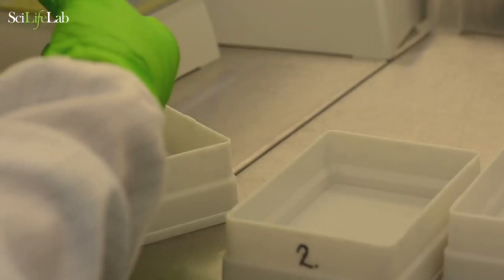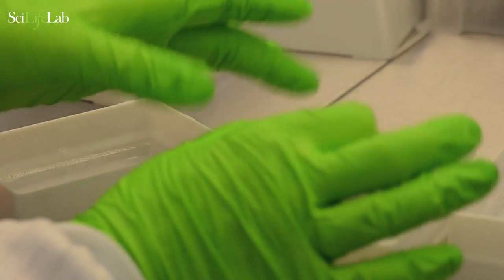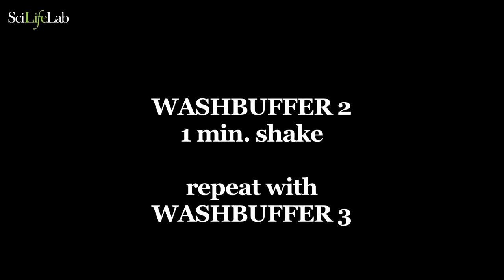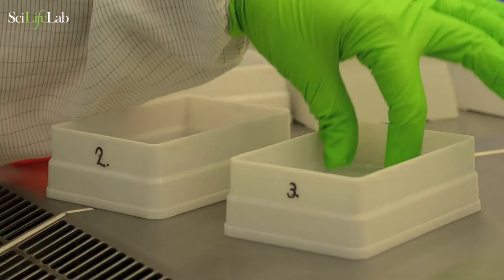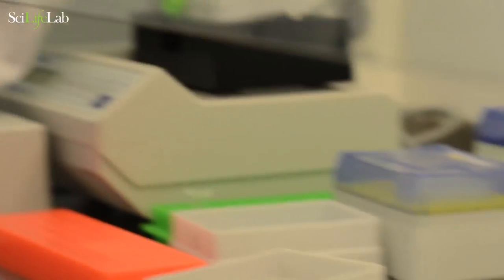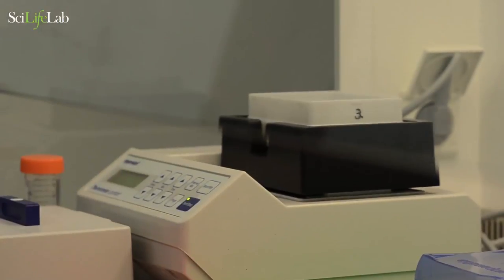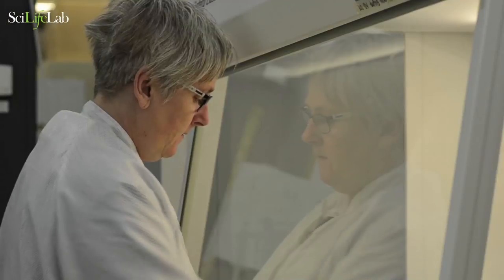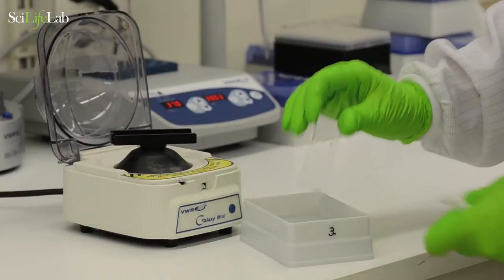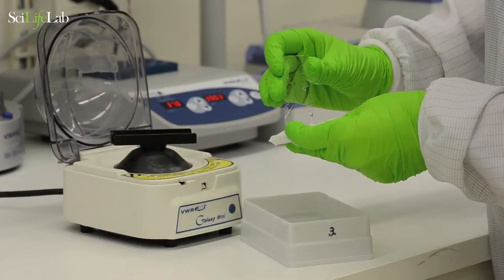Carefully transfer the glass slide to wash buffer number 2. Shake for 1 minute. Finally, transfer to wash buffer number 3. Spin dry the slide.